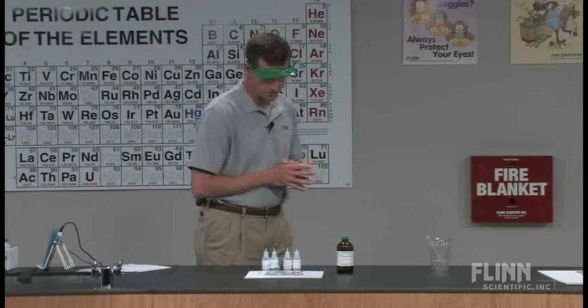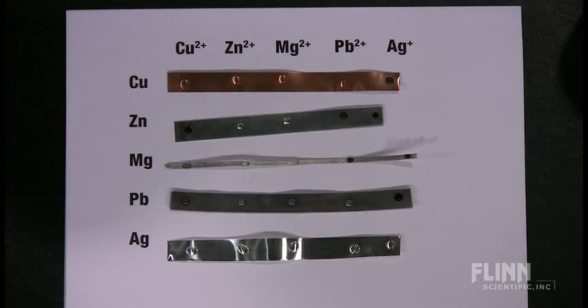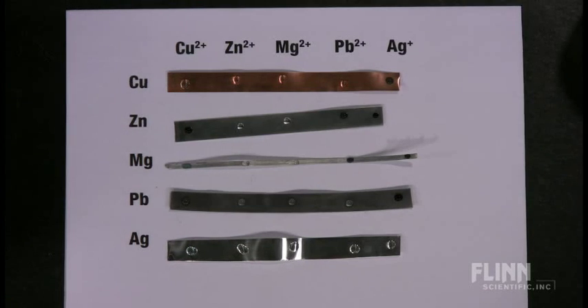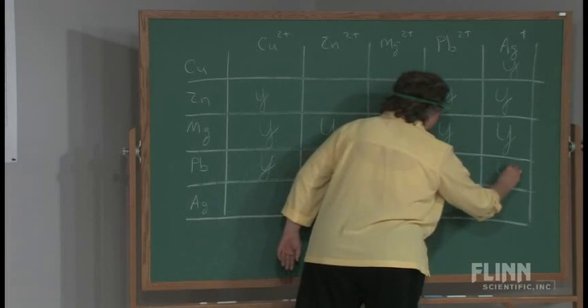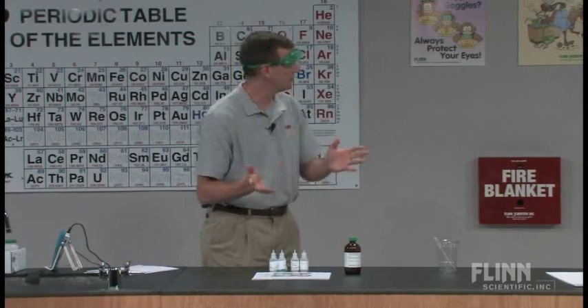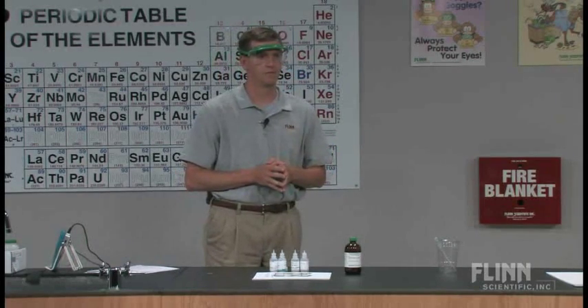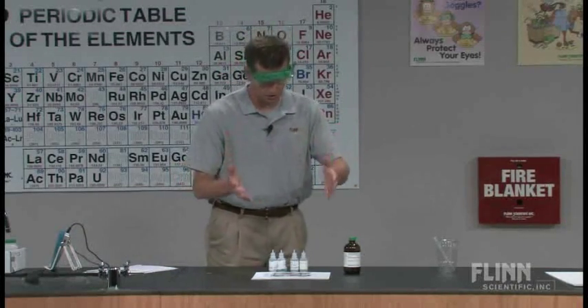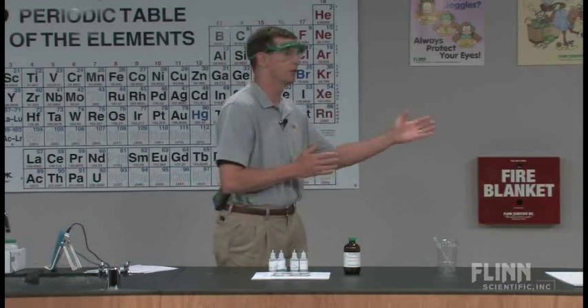In the next one with the lead strip, I see the copper(2+) forming a precipitate, and I see the silver(1+) is forming a precipitate. And then in the silver, there doesn't appear to be anything happening at all. So now we can translate what's going on in front of us to what's going on on the board.